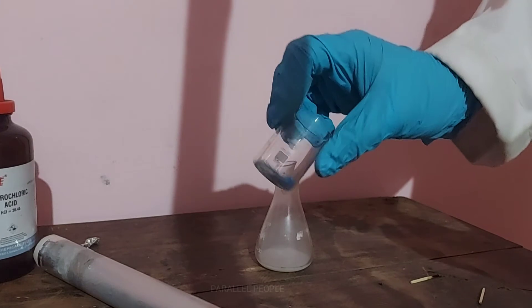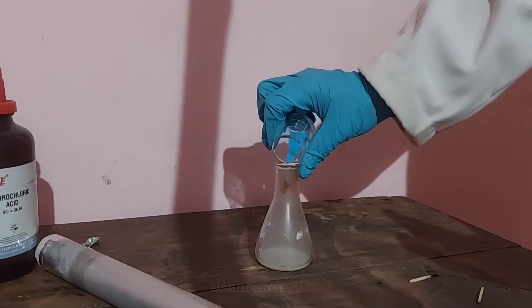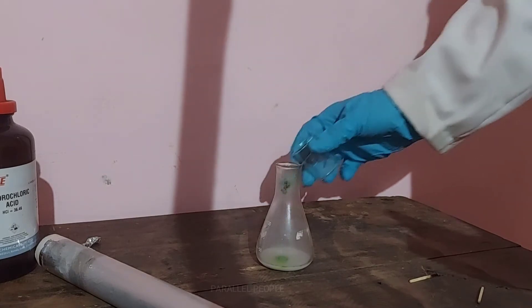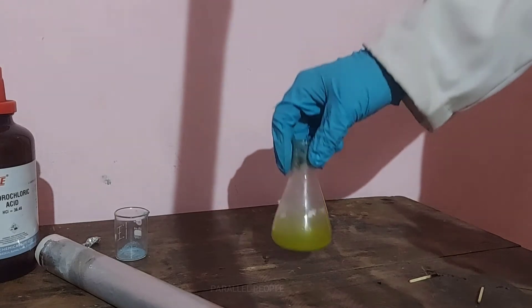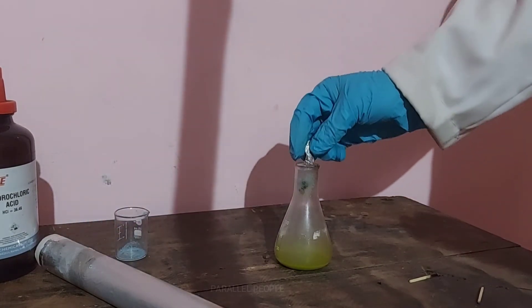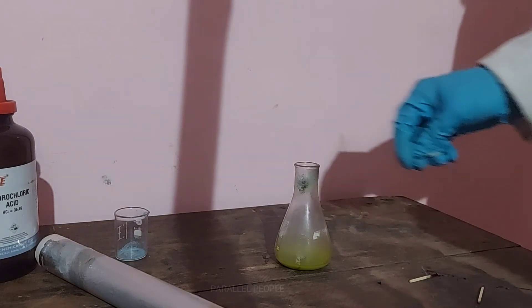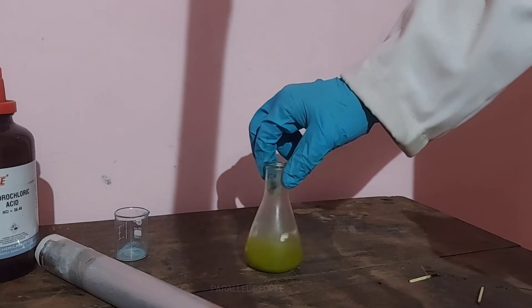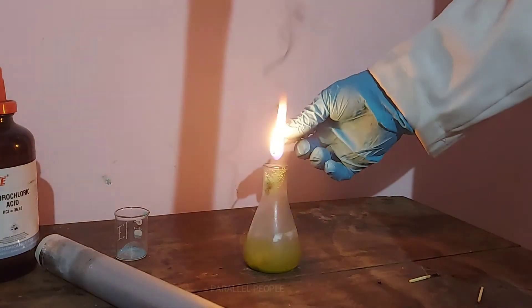When you add copper sulphate, it will also react with hydrochloric acid, but that is not significant here. Any compound of copper — copper sulphate, copper chloride, or similar — will give the same color, which is basically blue. It's not exactly blue all the time, but it is nearly blue, because copper gives that kind of blue flame, and sometimes copper will also give a green flame. Here we can see the combined color of the hydrogen gas and copper sulphate, which is blue.